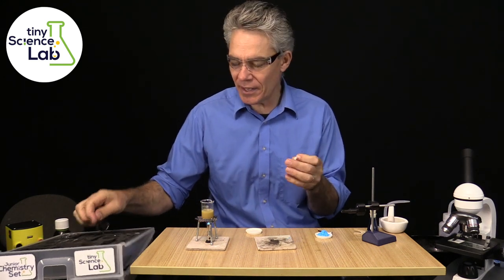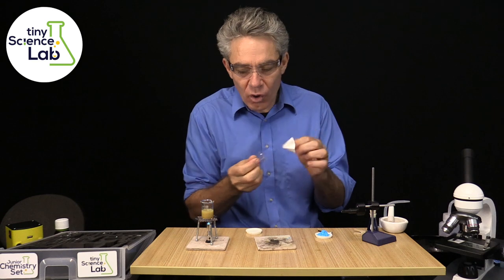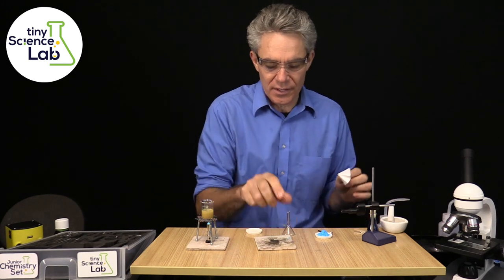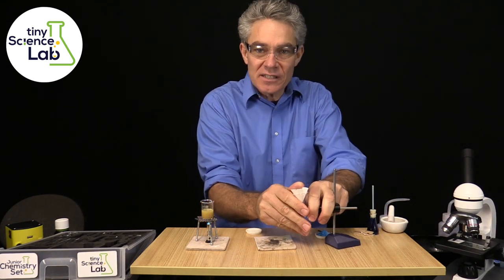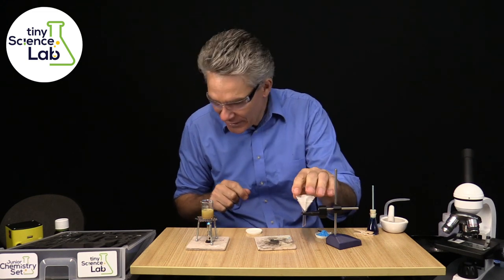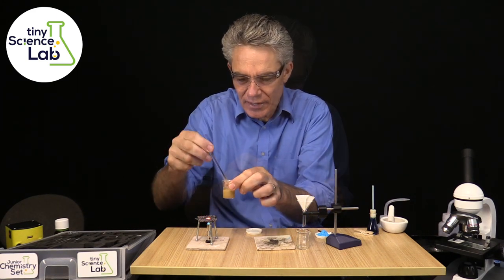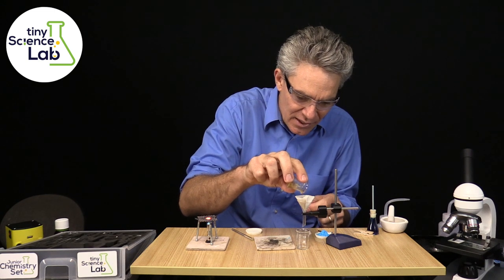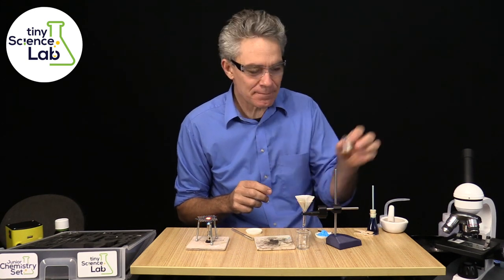I've got a little filter paper here and a little glass funnel. All the equipment is high quality — it's all glass, it's the same, just a little bit smaller. And being smaller means it's safer. It's being held in the retort stand that we developed. I'll put another 10 ml beaker here and give this a final little stir. I can transfer this mixture to the glass funnel and it won't take too long. Look at this — the filtrate is coming through nice and clear.